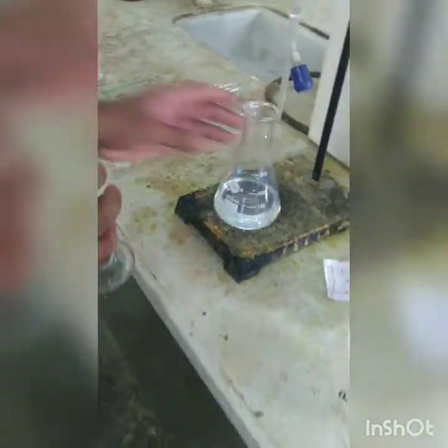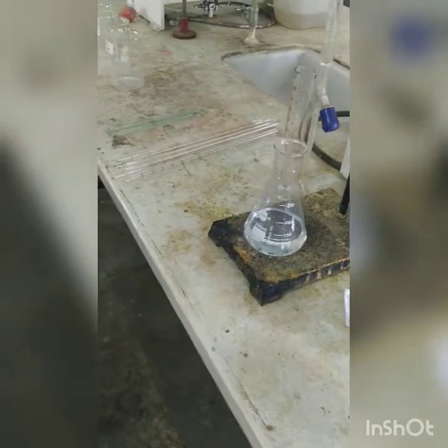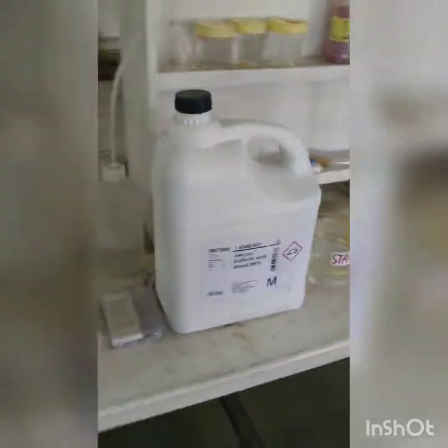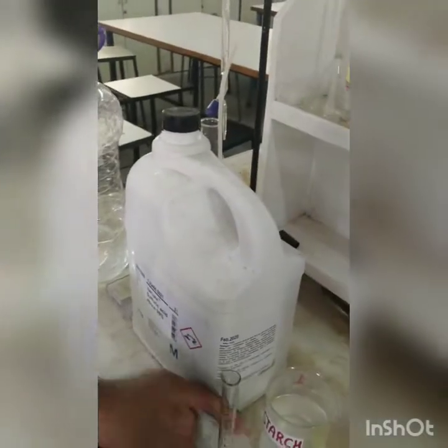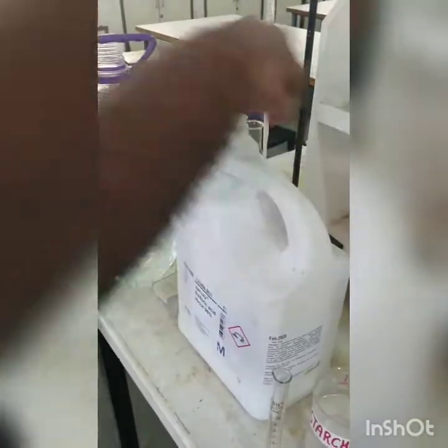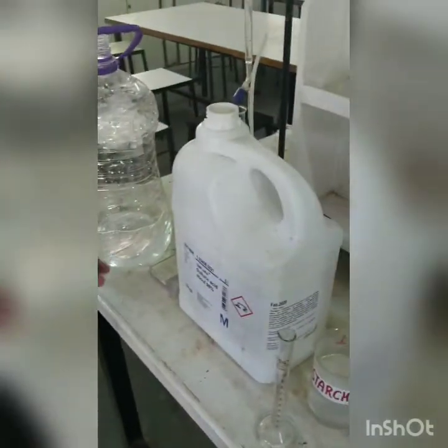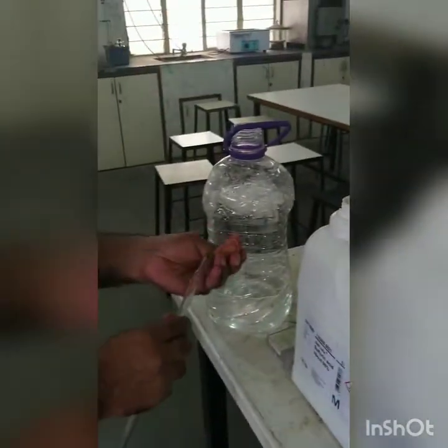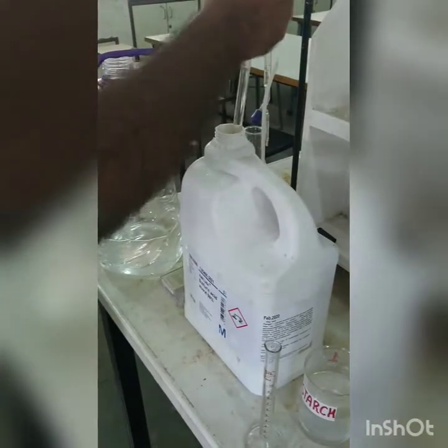Now to this particular solution we are going to add 10 ml of 10% H2SO4. That means we have to take 1 ml of sulfuric acid. So 1 ml of sulfuric acid we have to extract. Now when we are extracting sulfuric acid, it is concentrated, so ensure that you are not sucking it with the pipette, but you are using a rubber ball. So you can see here a rubber ball balloon is used. Ingole sir is extracting that.